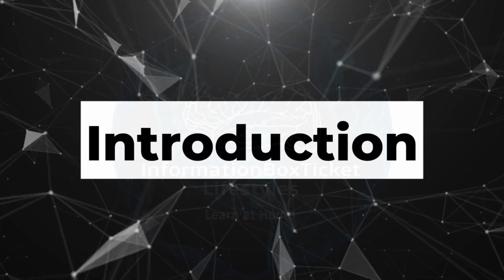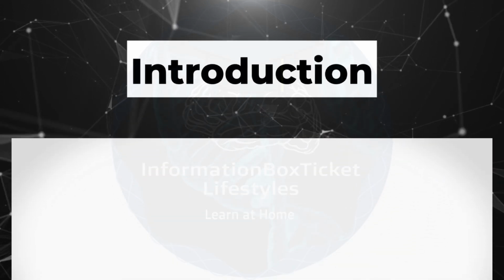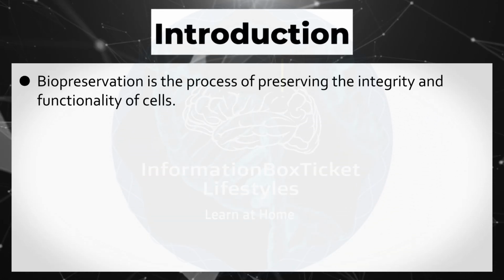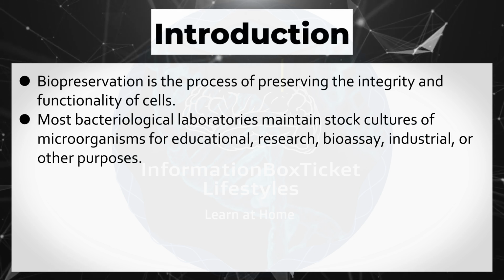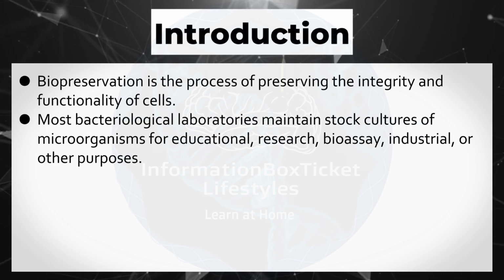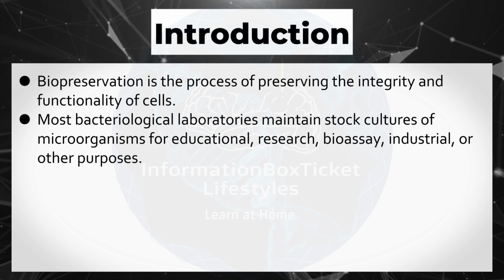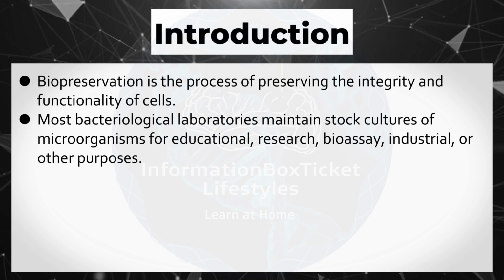Introduction to bacterial and fungal preservation methods. Biopreservation is the process of preserving the integrity and functionality of cells. Most bacteriological laboratories maintain stock cultures of microorganisms for educational, research, bioassay, industrial, or other purposes.